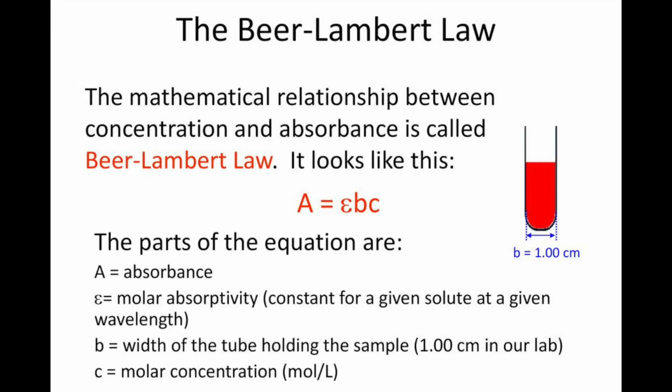Before working with the spectrophotometer, we made sure to understand Beer-Lambert's law, which includes absorption, path length, and concentration. Absorption is found by using scans, and concentration can either be calculated using known information about the substance or by determining the concentration based on absorbance.